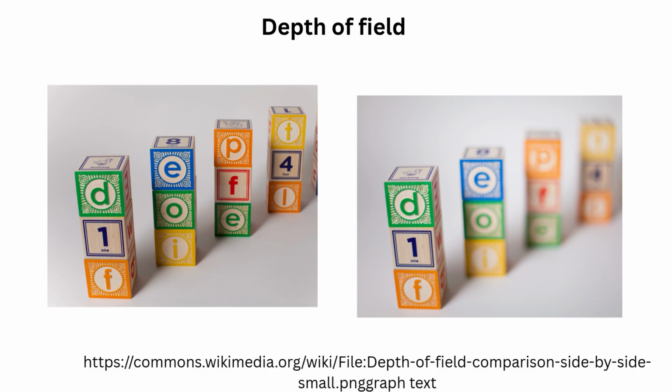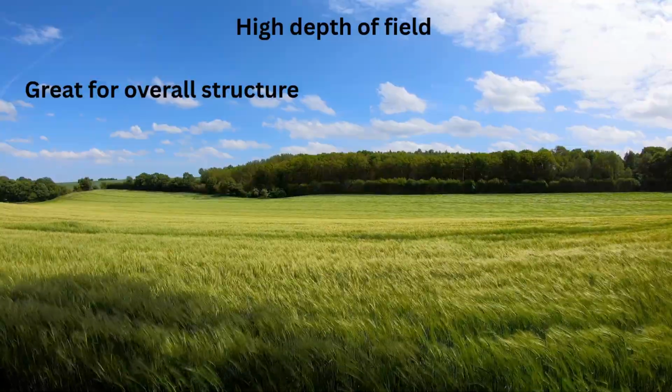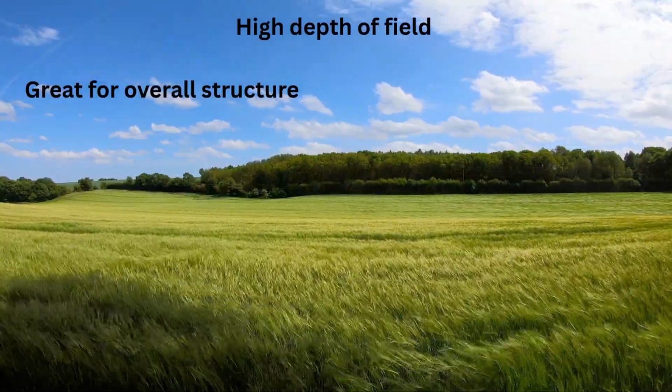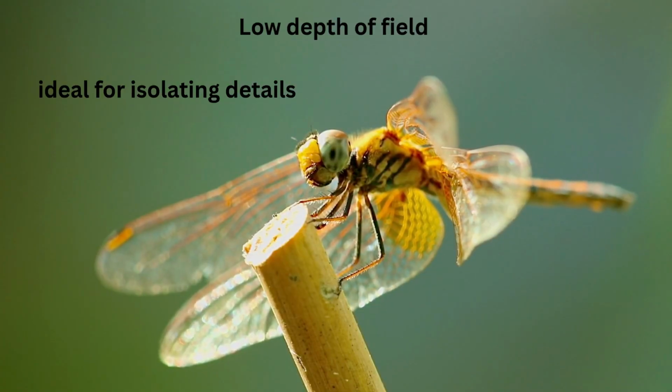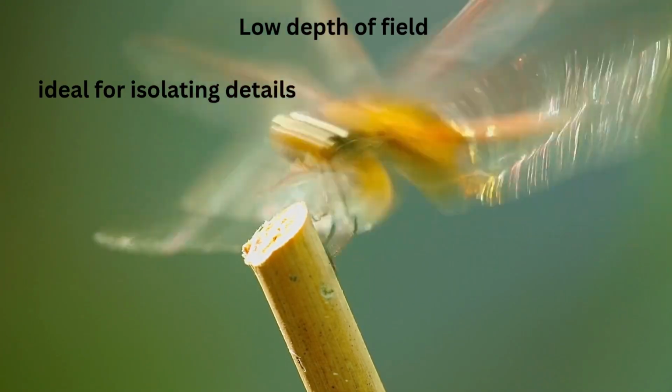Depth of field or DOF will tell you how much of the image from front to back is in clear focus at the same time. So, high depth of field means multiple layers are visible at once, which is great for overall structure. And low depth of field means only one layer is sharply focused, which is good for isolating details.